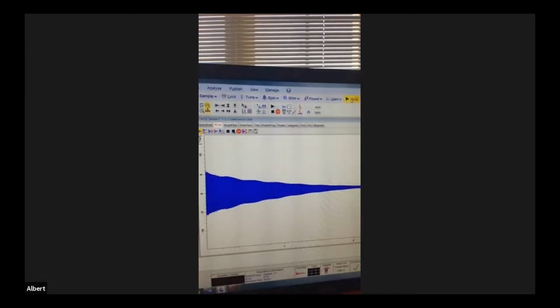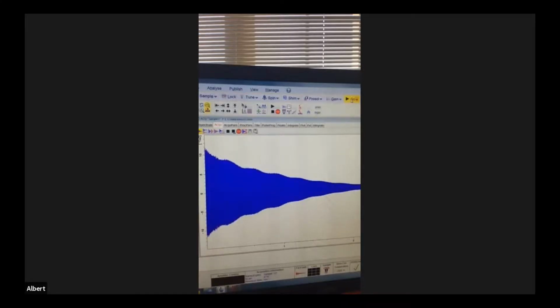All right. So you'll see the FID, and it's the same for every sample. You're going to have an FID coming up, and for every proton NMR, we click that proton command at the beginning. That's telling you it's over 16, it's already pre-programmed. 16 scans.